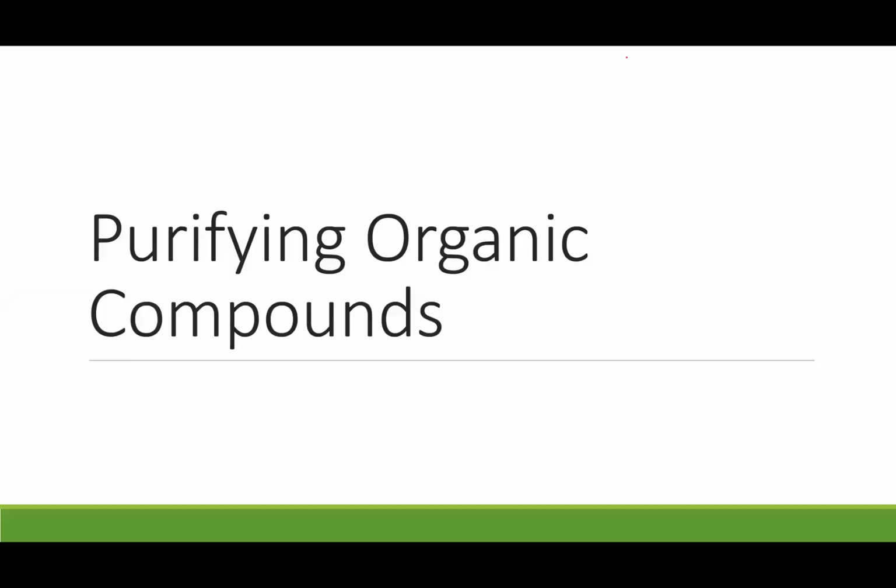Okay, in this session, we're going to look at purifying organic compounds. It's not the end of the organic chemistry topic at the moment, but it's just where this one fits in. And it is a practical skills topic. So we're going to talk about a lot of different practical skills that you might use and that you need to know how to do and carry out.